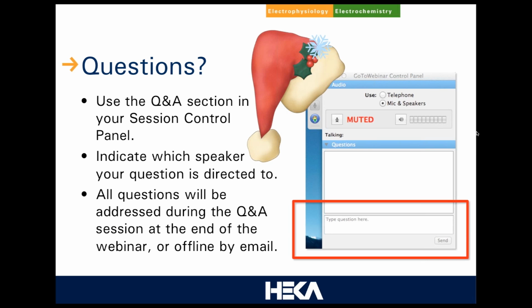Okay, one more question. Then we're going to finish the webinar because we're already a little late. When one is performing perforated patch clamp and one wants to invoke action potential in cell culture, do you recommend to use a holding potential of minus 70 millivolt before changing to current clamp mode? Yeah, I would say that depends on the cell type. The question, Lars, remind me, does the question say what cell type that is? No, it does not. Perforated patch clamp.